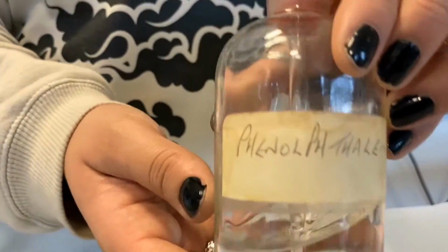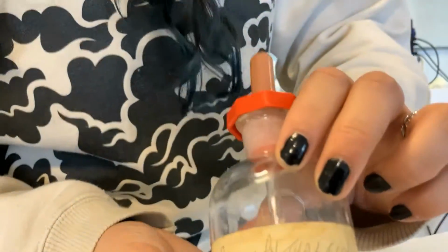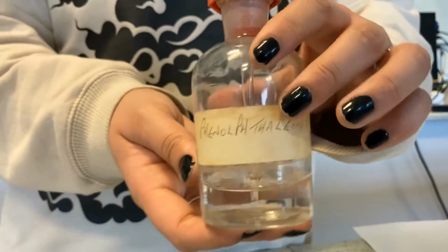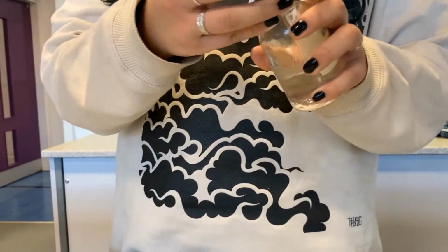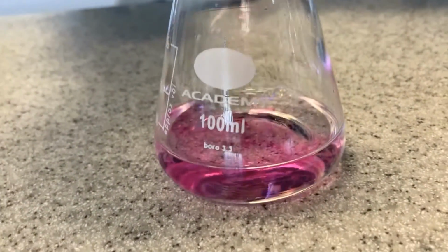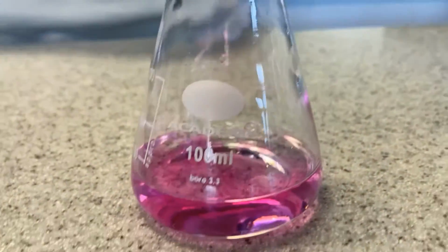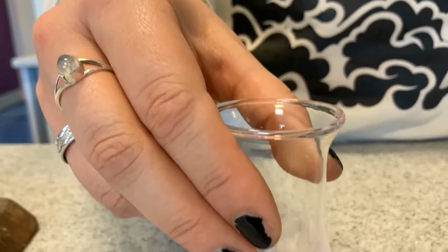Well, we have this beautiful substance called phenolphthalein. Ten merits if you can remember how to spell it for the rest of your life. Okay, so this is an indicator. We're just going to add a few drops. We don't need a lot. So you can see in an alkali, it is pink.